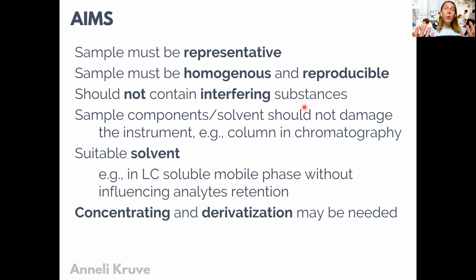So why do we prepare samples, or rather, how should we prepare the sample? Of course, we want to prepare the sample so that it would be suitable for the analysis. But what does that mean? That means that the samples should be representative. That means that the concentration of the prepared sample that we now start measuring with our analytical techniques should actually represent the analyte concentration in the real samples. Also, the sample should be homogeneous and the preparation should be reproducible. That means that the reproducibility that also incorporates sample preparation should be as good as possible.